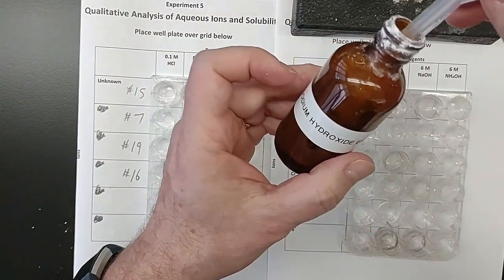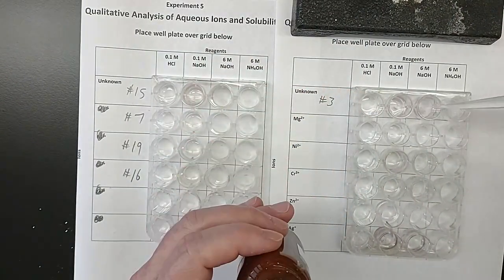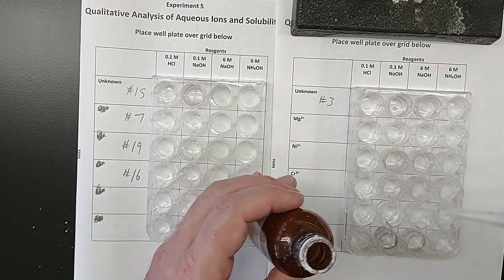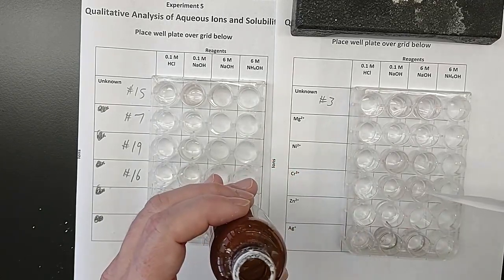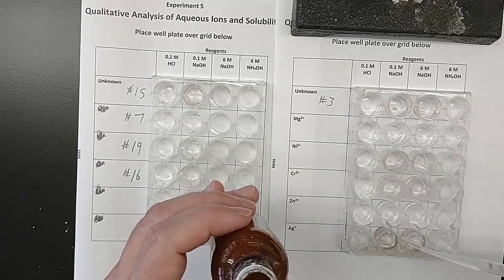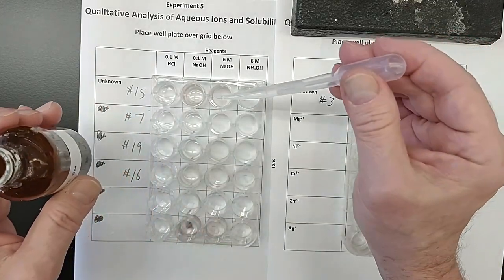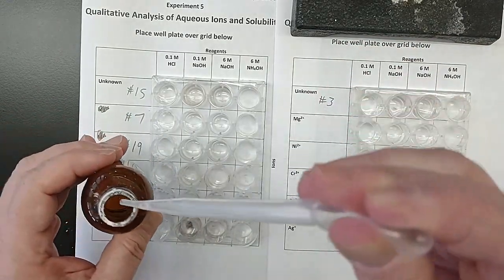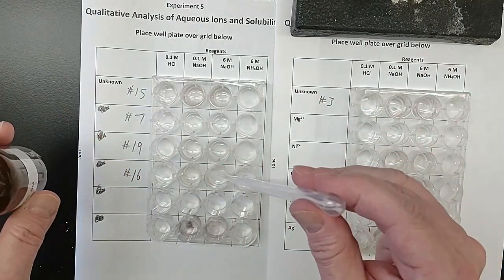Okay, 6 molar sodium hydroxide. So I do roughly 10 drops all the way down. I could be wearing gloves for this, but I'm just choosing not to and to be careful.